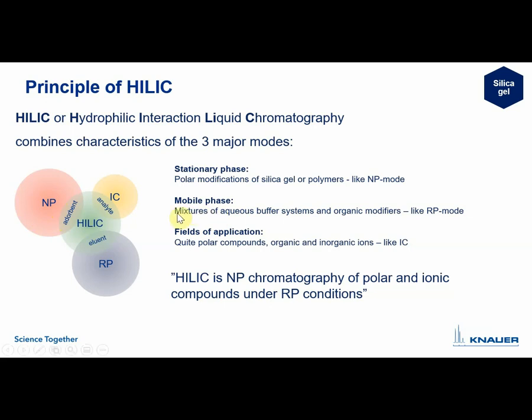The mobile phase would be a mixture of aqueous, most often buffer systems. Sometimes buffers are not needed, but most often it's recommended. And organic modifiers like acetonitrile. And this is like the reversed phase mode. So the eluent is really similar to reversed phase. But the field of application, of course, is different.